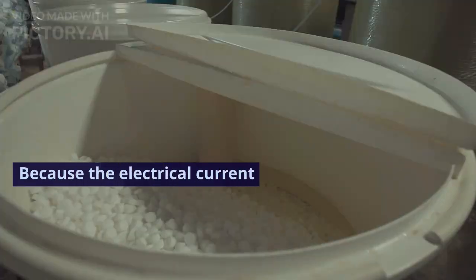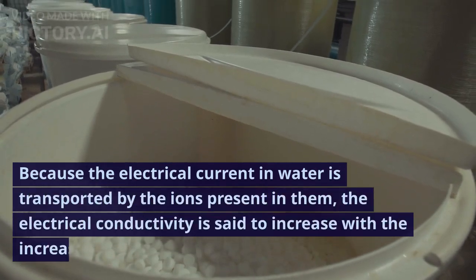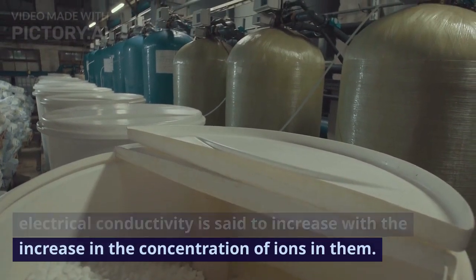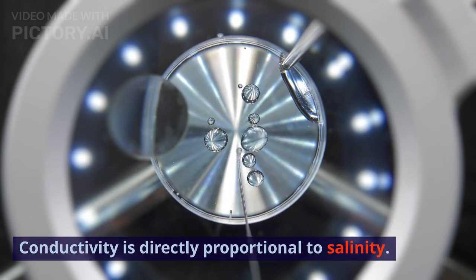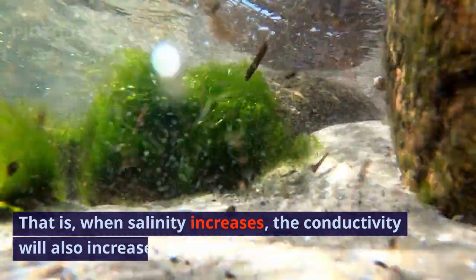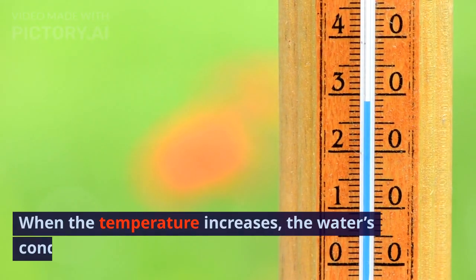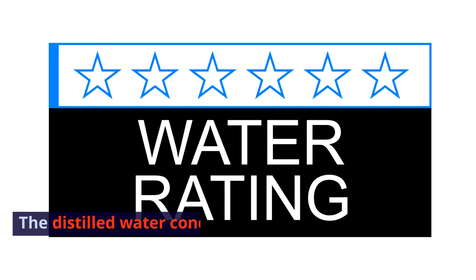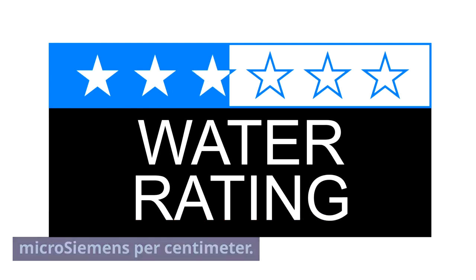Because the electrical current in water is transported by the ions present in it, the electrical conductivity increases with the increase in the concentration of ions. Conductivity is directly proportional to salinity. That is, when salinity increases, the conductivity will also increase. When the temperature increases, the water's conductivity will also increase. The distilled water conductivity is 0.05 microsiemens per centimeter.